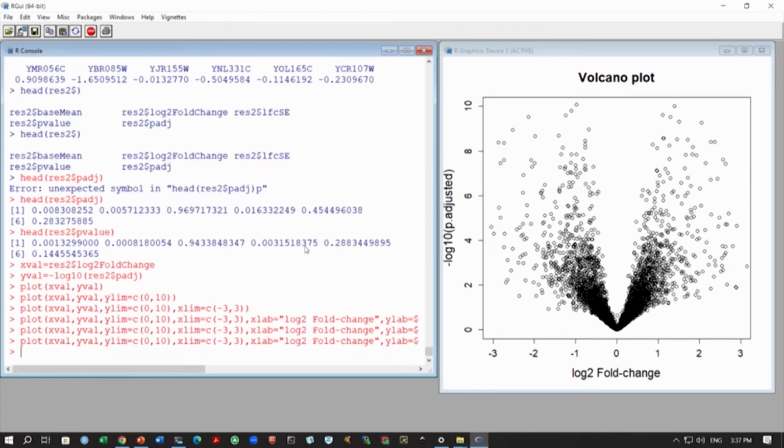We can also put the thresholds for this p adjusted, because if you set, let us say, FDR at 0.1, then we are looking at minus log10 p adjusted to be 1, and maybe we want to put this cutoff and show which genes are above it. Because when you transform this p value by minus log10, a higher value of minus log10 p adjusted means more significant results. So, we can set the cutoff now. This will be using this command.